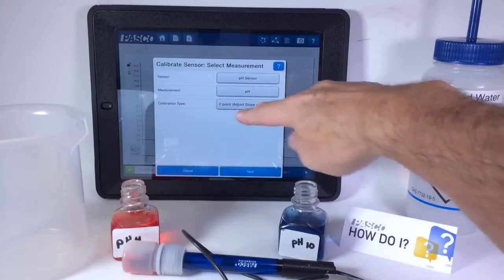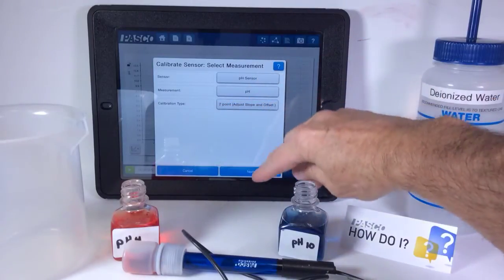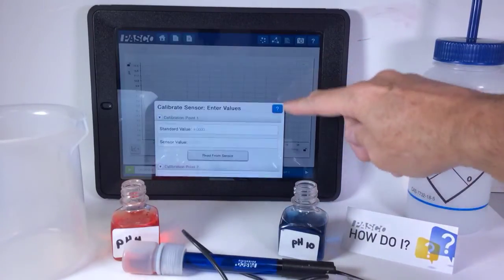Once it's found the pH sensor, it says two-point. That's the default. That's what I want. Next.